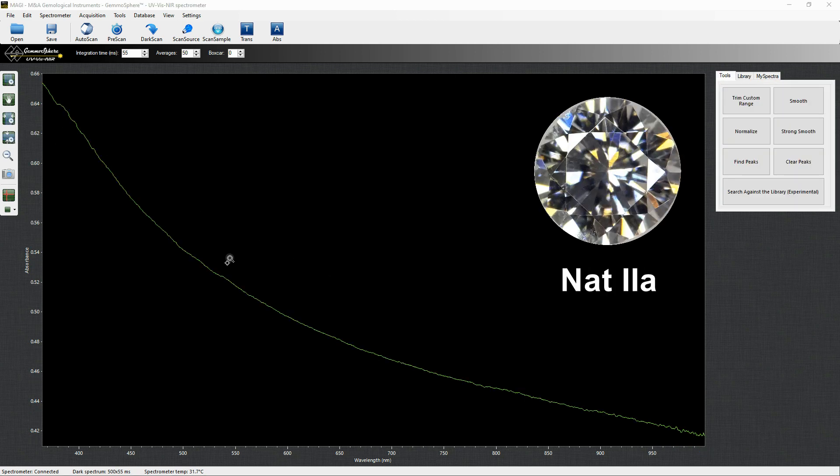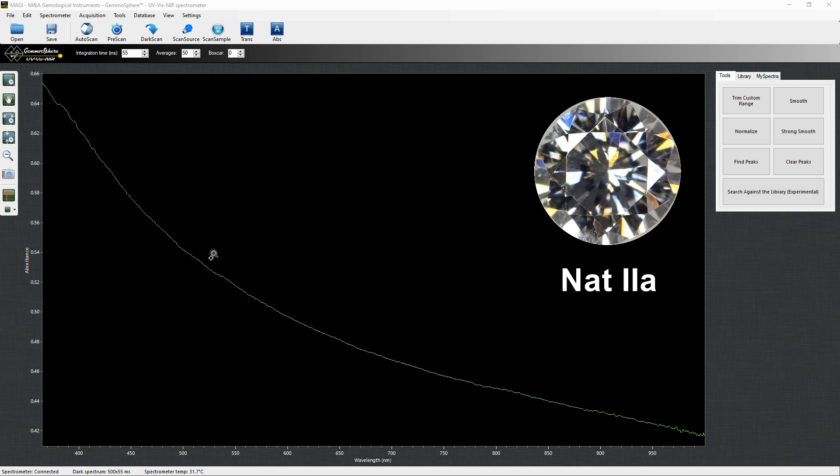This is the spectrum of a natural 2A diamond. Of course, the nitrogen-related peaks are missing and there are no significant other features. Since both HPHT and CVD colorless synthetics are type 2A, a diamond featuring such spectrum could be either natural or synthetic.